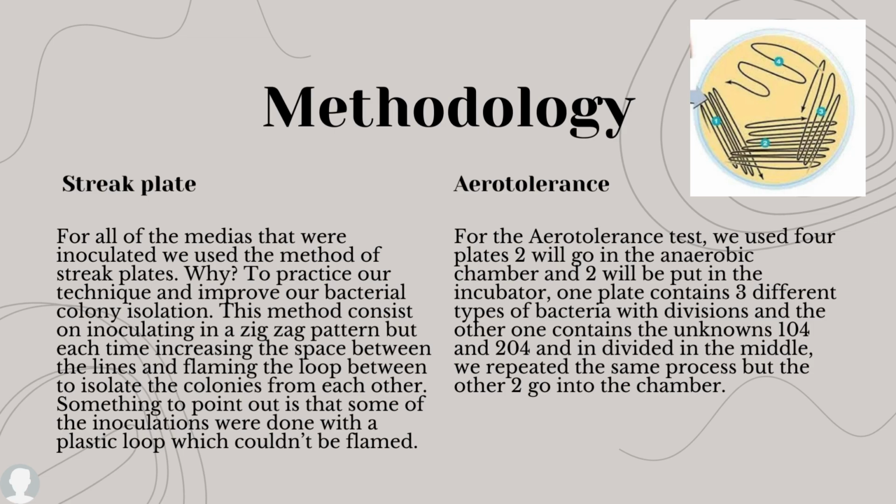The methods used included streaking of the plate and the aerotolerance test. For all of the media that were inoculated, we used the streak plate method. This was not only to practice our technique, but also to improve our bacterial colony isolation.